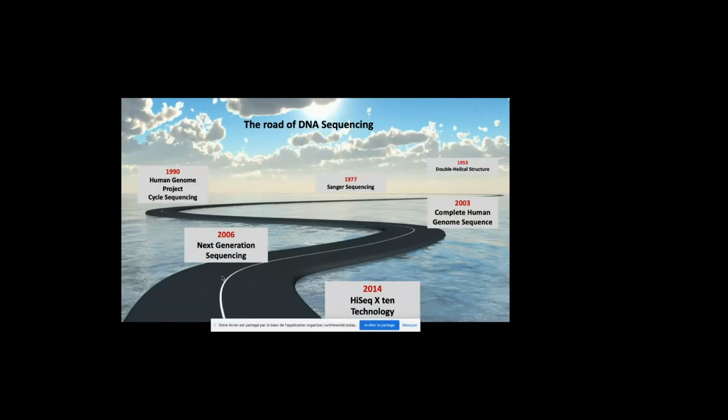At the end of this DNA sequencing road, I want to cite HiSeq. Even though the road is still long, we have others like NovaSeq, which are present here on the market. But why have I chosen HiSeq? Because its sequencing capacities reach another scale of performance.